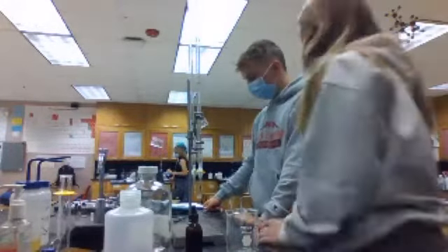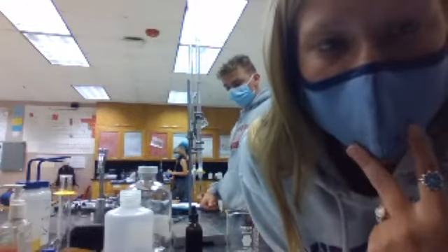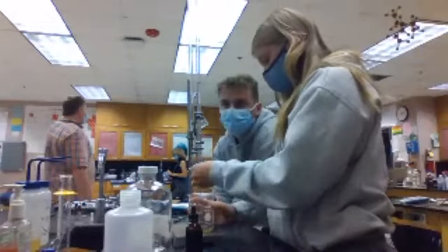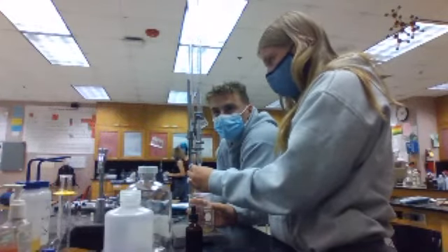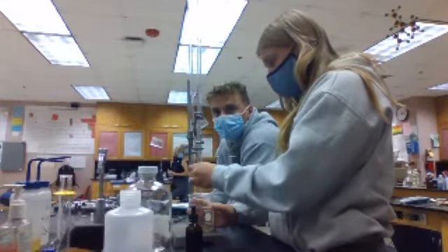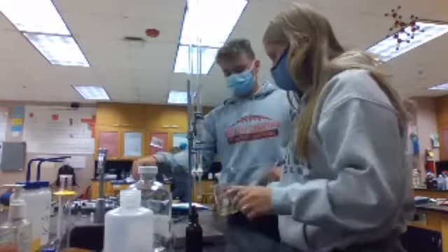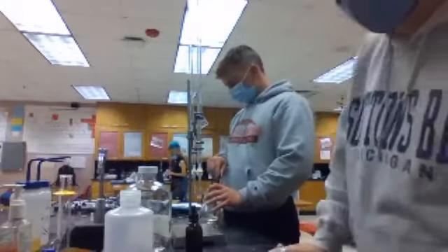1.01 for 2 milliliters. Oh, 1.11 for 2 milliliters. Okay. What's that? 9.5. No, it isn't. Oh, it's green now, right? I would call it there, because that's where the transition from yellow to blue is when it turns green. There's yellow and blue, maybe green. See? Oh yeah, it's yellow and it's just blue. It's all just colors. Doesn't matter at all.